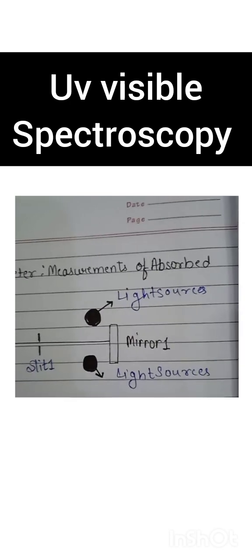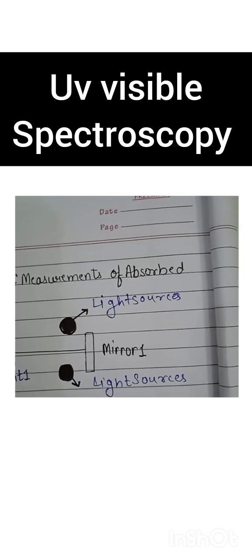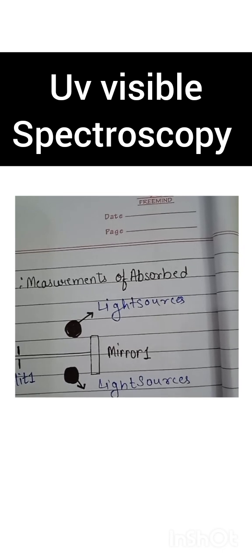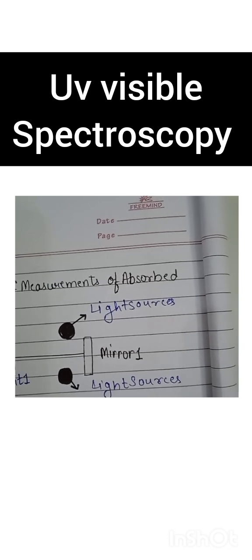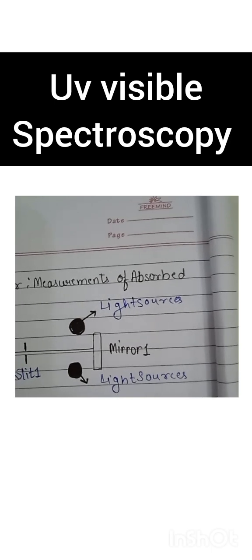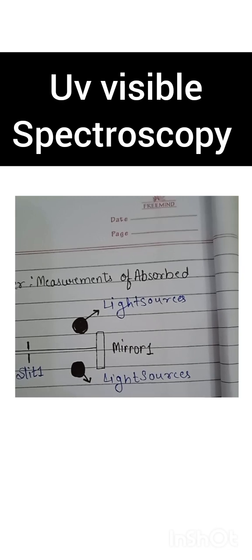Unfortunately, such a source does not exist. Two different light sources have historically been used in UV visible spectrometers. The deuterium arc lamp was used to provide a good intensity continuum in the UV region and useful intensity in the visible region. The tungsten halogen lamp yielded good intensity over the entire visible range and part of the UV spectrum.